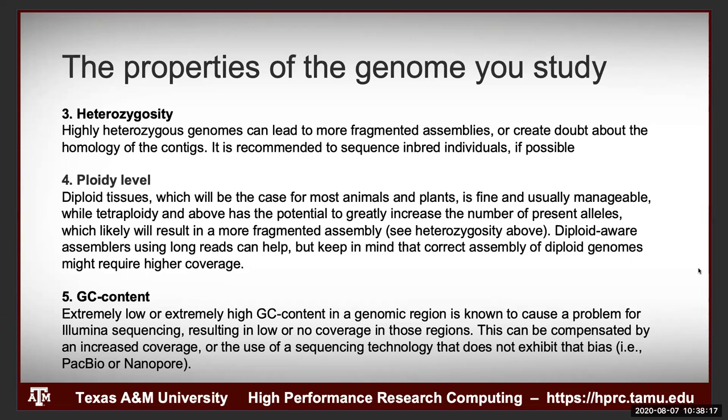So it's much easier. But for doing that, you need something called flow sorting that can separate chromosomes. So you need something else to help you do that.